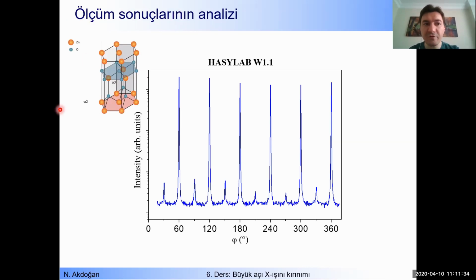But if you use in-plane X-ray diffraction, you will see that plane, that plane, that plane. If you rotate this one around itself, you can see all planes, and you can see signals from all planes.